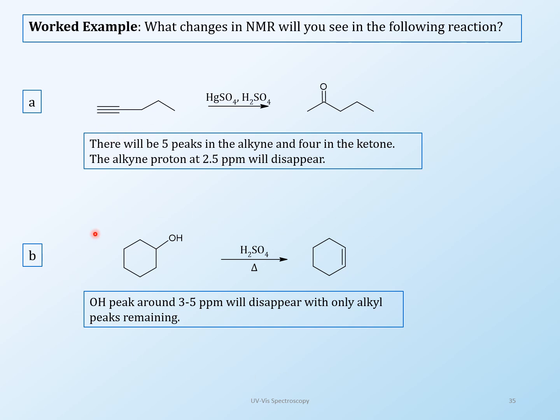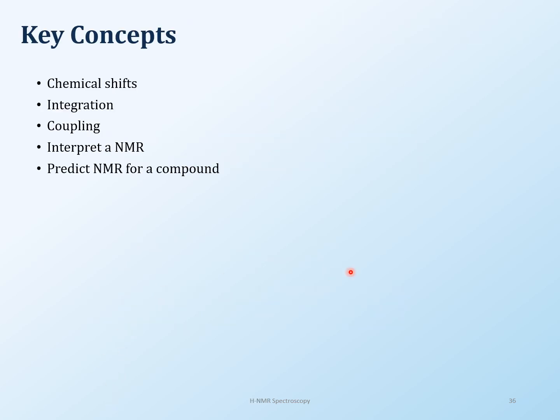In this case, of course, you will have an alcohol peak, and in your product you should not have an alcohol peak. That will help you to determine if you have your structure, and of course you look at other things as well. I think that's it. I know that was a big thing, but it's done. Okay, let me know if you have any questions.